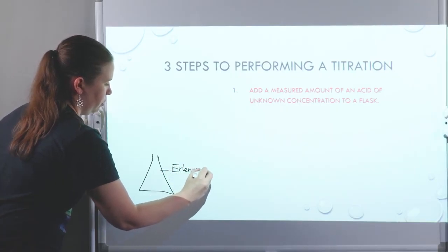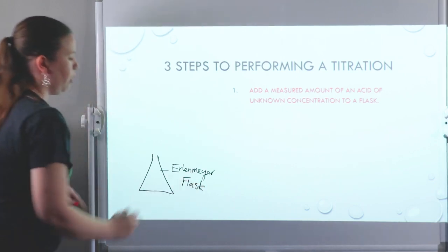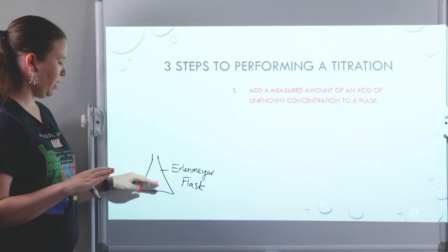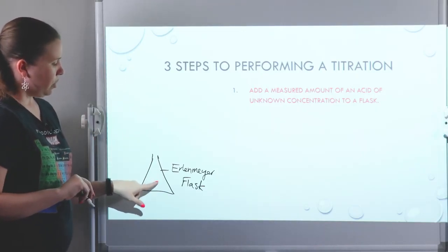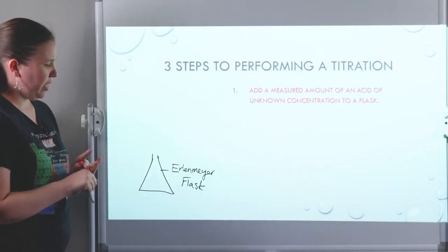Erlenmeyer flask. You always want to carry out reactions in an Erlenmeyer flask because it is designed to keep in the reaction. So we're going to be neutralizing in this flask. And yes, you need to know the name of this flask.